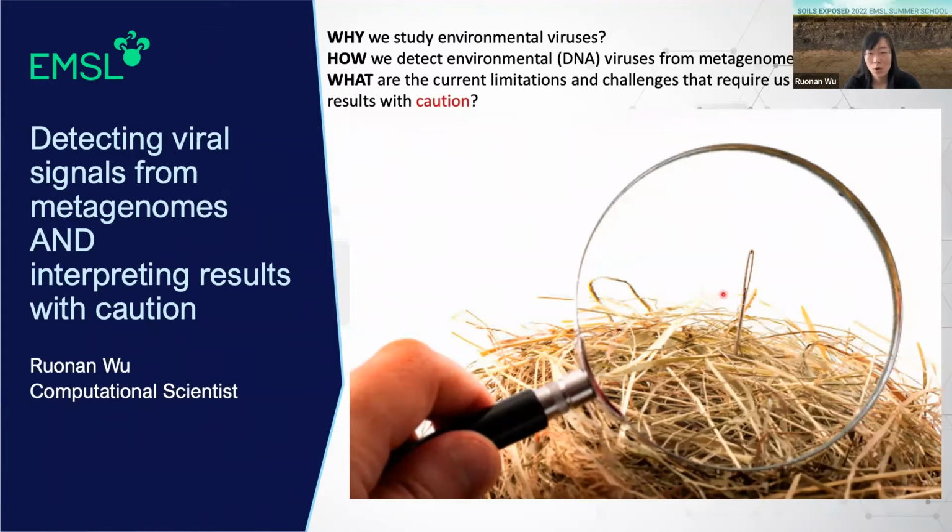So today I will walk you through the basic steps, review tools or methods to use, then highlight potential challenges and limitations for each step, and then suggest mitigation plans. Also, due to the time limit, I probably won't be able to provide detailed commands or scripts for you to run each of these tools, but hopefully can provide you with a comprehensive overview of how to study viruses using bulk metagenomes.